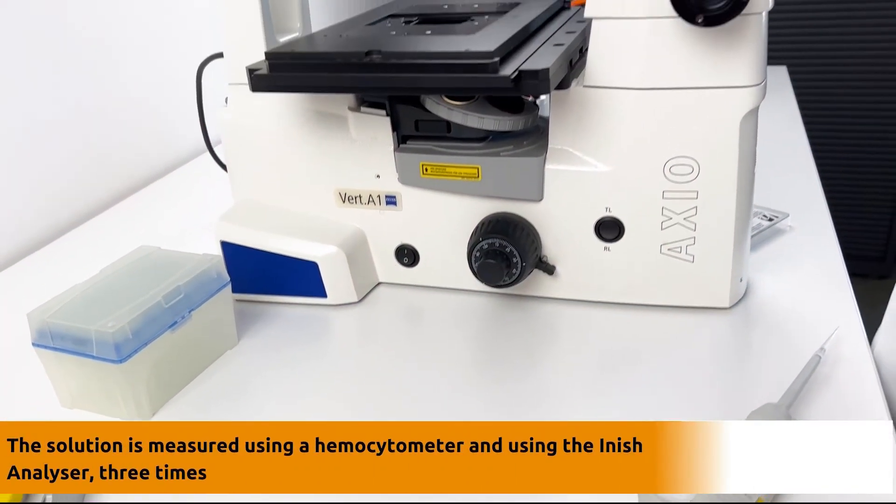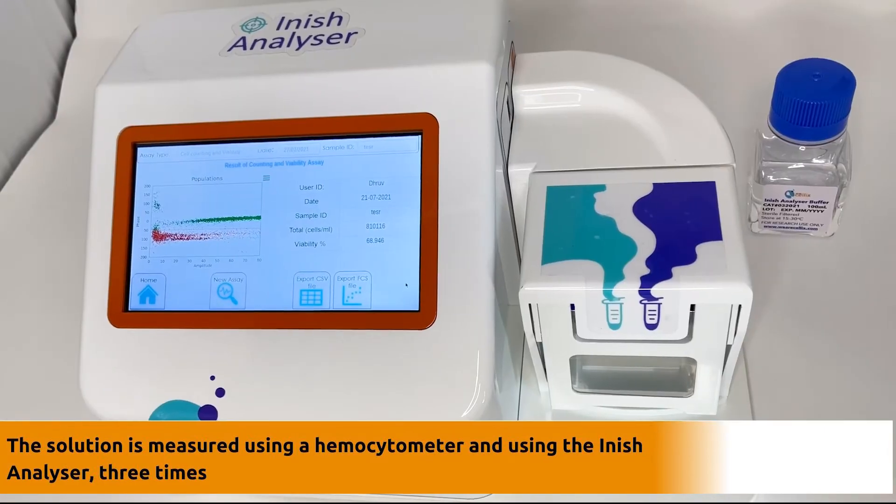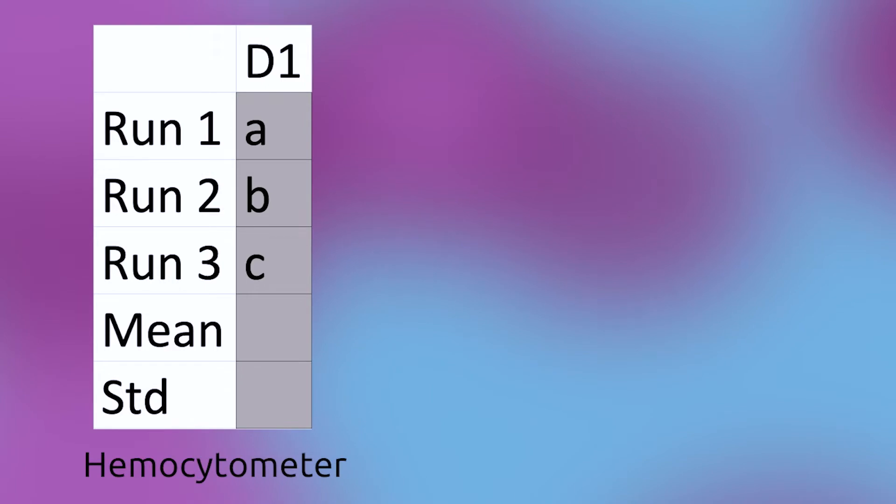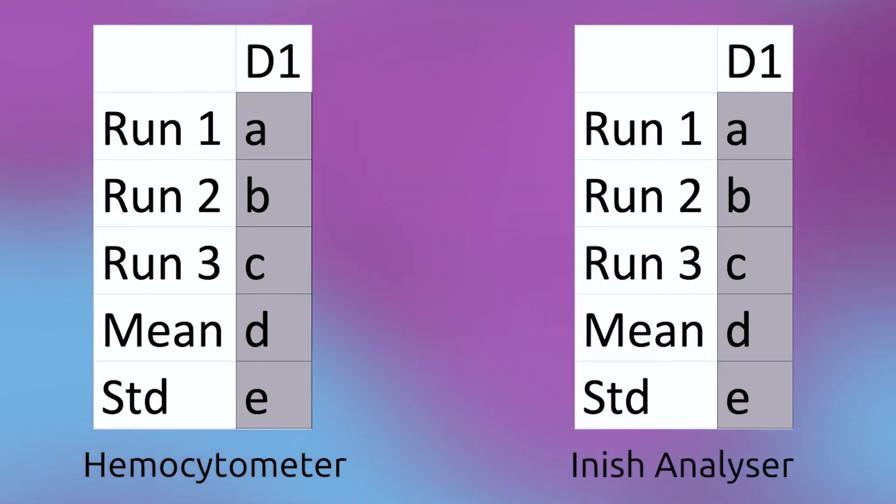D1 is then measured using a hemocytometer and using the Inish analyzer three times. We're measuring the concentration at least three times to calculate both the mean and the standard deviation of the measurements for a rigorous comparison.